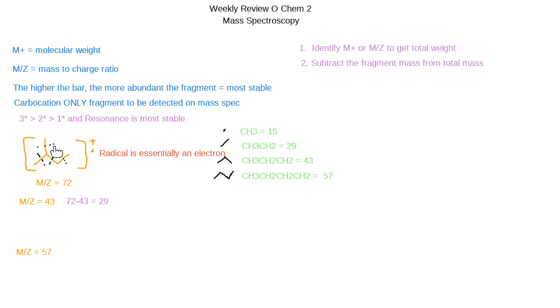And the reason why, just a reminder, you can only cut through a bond. You can't cut through an atom. And especially if there's a fork like this, you can't cut around it, anything like that. Okay? So 3 of these only cut a single methyl. That's this one, or this dotted line, and this dotted line. And if I cut that, it will only give me 15, which is why we have to go to the last slash, which is 29, okay?